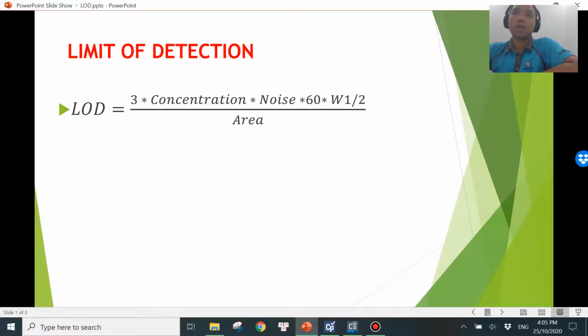Hi, welcome to another video in which we'll be talking about another formula to calculate limit of detection that I have seen recently.